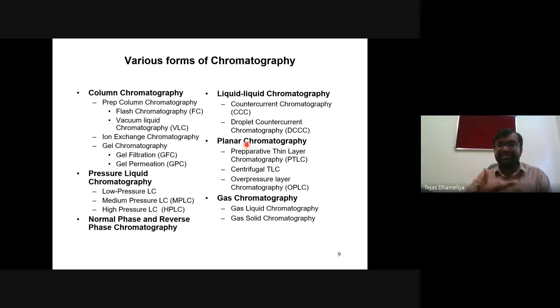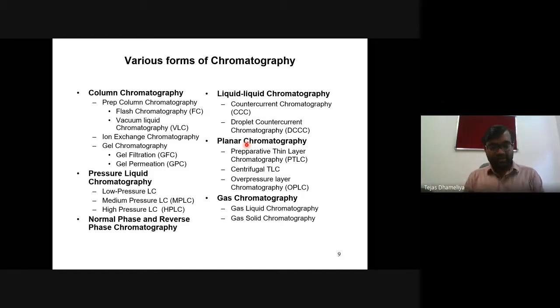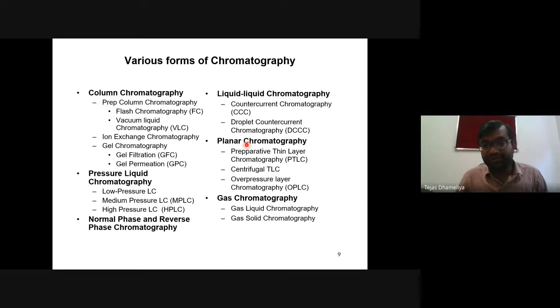You are developing the TLC plates using silica gel, drying in an oven, spotting with your compound, whether it is the starting material or your end product. Then you run it in the mobile phase to check the RF value of the particular compound. तो ये लोग ये भी आप करके आए.